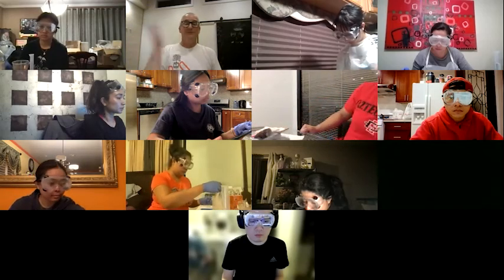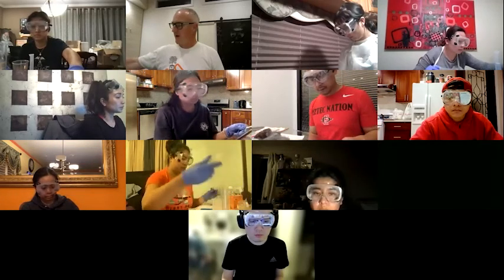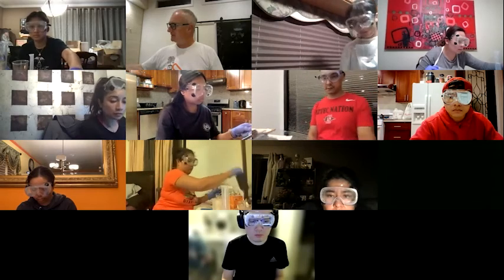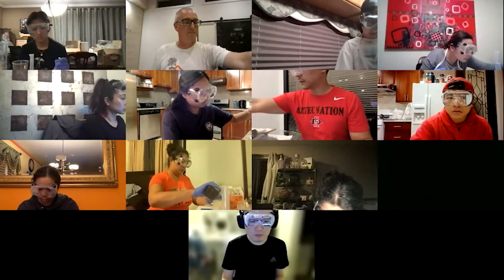Oh man, I got this enclosed room and it's just burning that little bit of iron. That's intense. It is really pretty though, so just don't let your kids see it because they'll be setting fire to steel wool all the time. Because it is really cool.